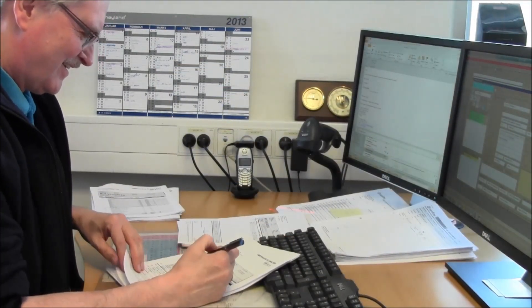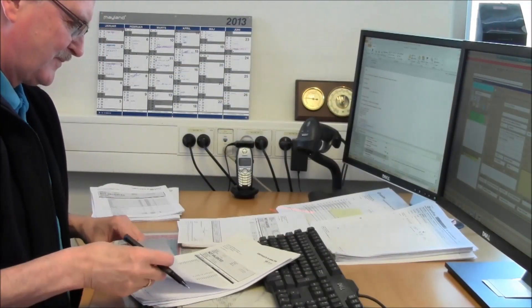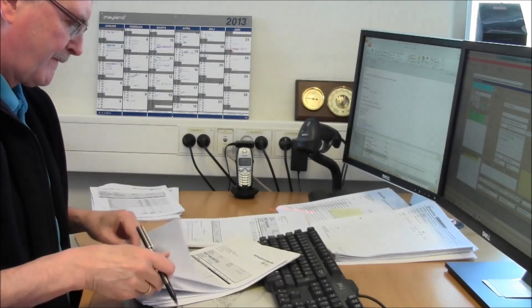From the Chromelian data, the final results are calculated and transferred into ELIMS electronically.